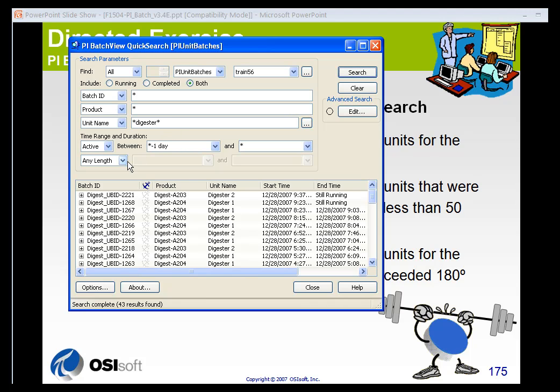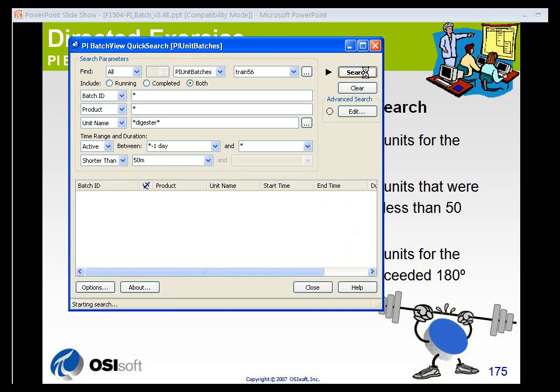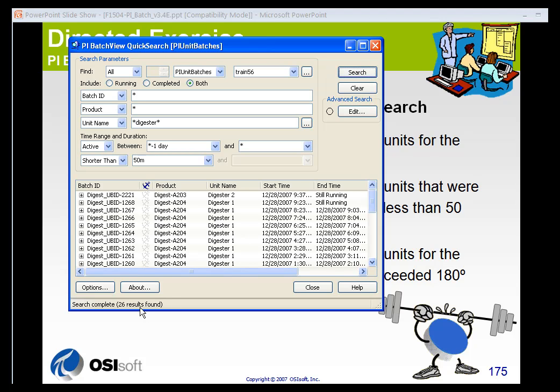Let's say I want to find all the batches that ran for less than a certain period of time — shorter than 50 minutes. So I'll enter shorter than 50M, click Search, and I can see that 26 of those results ran shorter than 50 minutes.